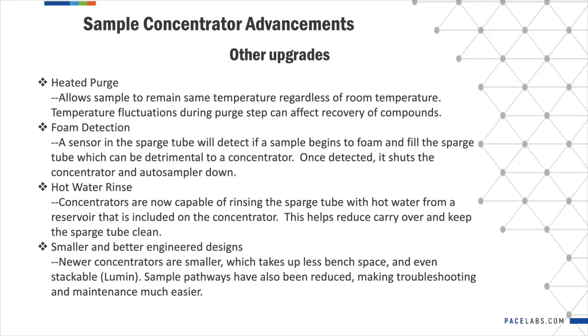Concentrators are now smaller as well and take up less lab bench space. They're also better engineered with reduced sample pathways, making maintenance and troubleshooting much easier.